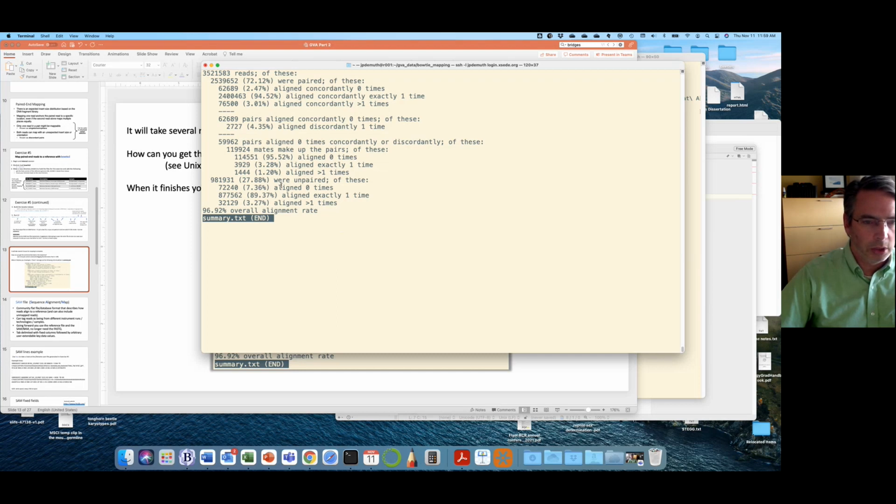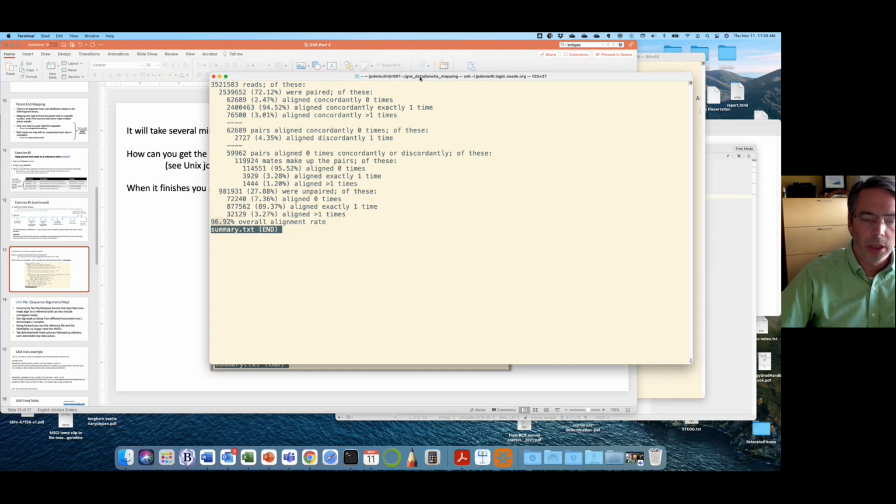So that's a really good result when you've got 96.9% mapping, because remember, I don't remember in this exact experiment, but they could be different strains, right? So reasons you get all this, the potential structural variation, things like that, could be different strains.